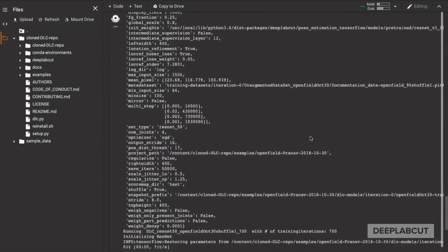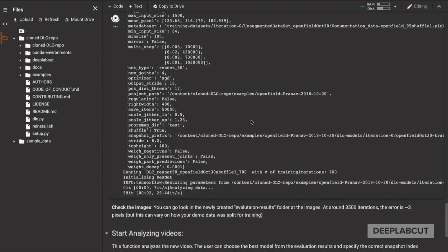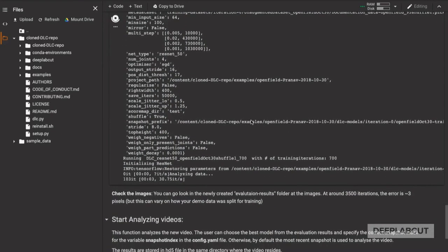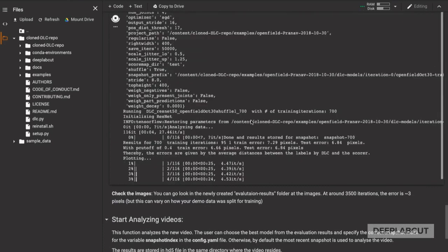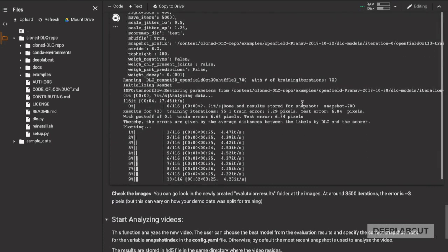You're going to want to see a low pixel error. Of course, we've only run this for a short period of time, so you still have around six pixel errors. In our paper, where we run this for the full amount, you're in the about two to three pixel range.